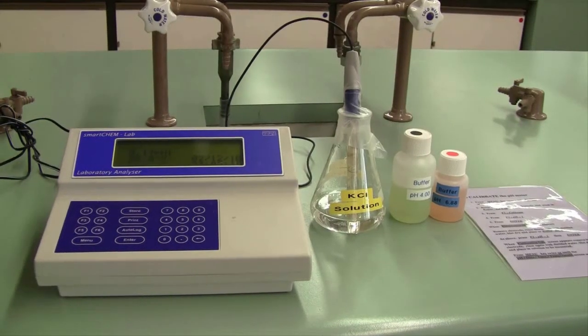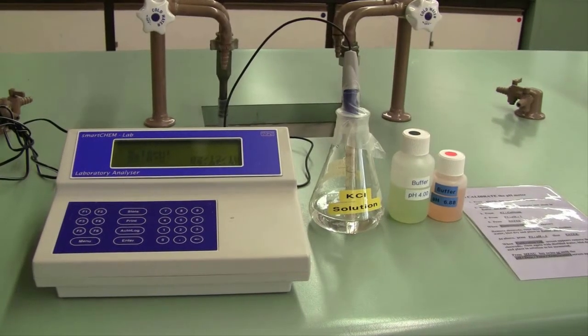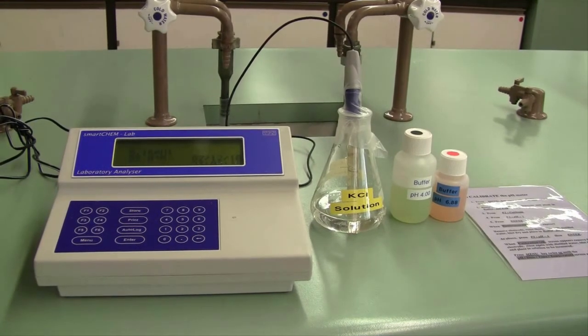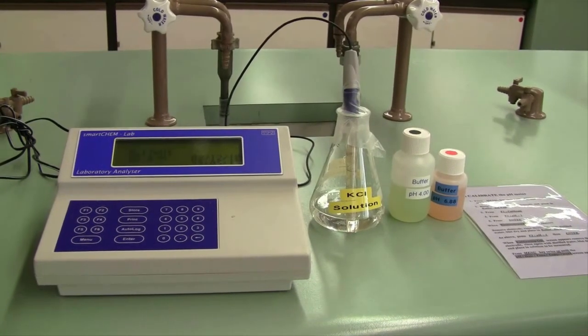In today's experiment, we're going to have a close investigation of some acid-base chemistry. We're going to look at the pH properties of buffer solutions, and we're going to use a pH titration to determine the concentration of ammonia in a commercial product.